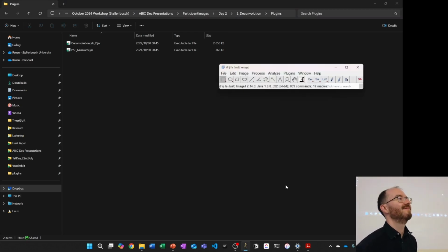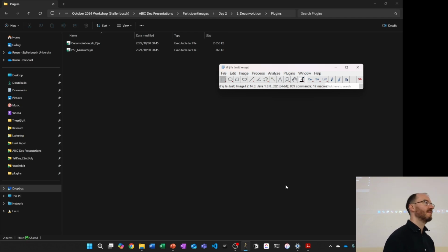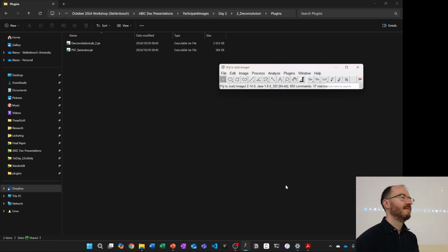I've got a question. So far, everything we've done influences intensity. So if you've got a sample and you want to analyze the intensity, and you need to apply the filters and all those things in deconvolution, for both technical and biological repeats, would you individually apply different parameters to each image? Or would you identify, for instance, if you add the Gaussian thing to it, the gamma, I can't remember what you call it, but that parameter there, would you get one consistent value for all the technical and biological repeats, or would you adjust that for each individual one to make them comparable?